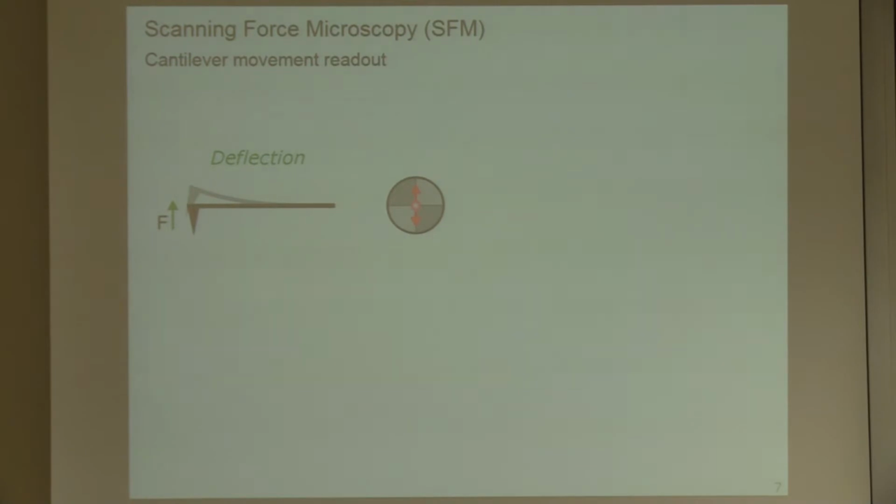Okay, I just want to start very basically with scanning force microscopy and make you aware of a quite difficult point in terms of quantitative data. It's pretty trivial that if you have your cantilever with the tip, then you can easily measure topography up and down and you can easily calibrate that, no doubt. If you have torsion of your cantilever, things become much more difficult, because for calibrating the torsion you need to know the height of your tip. Because there's a mechanical contribution to that, and the question is how can you calibrate torsion?